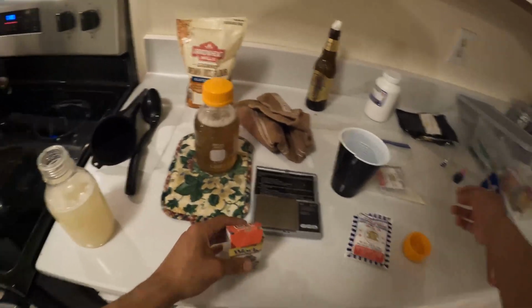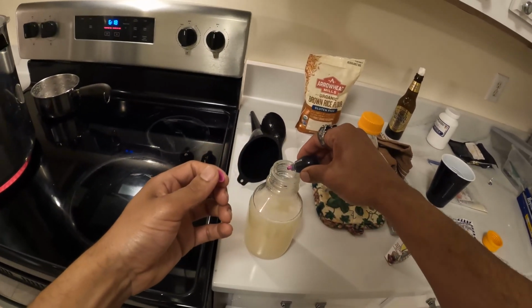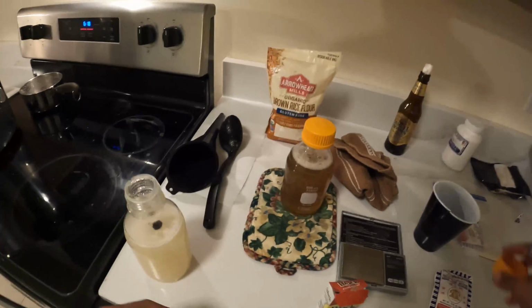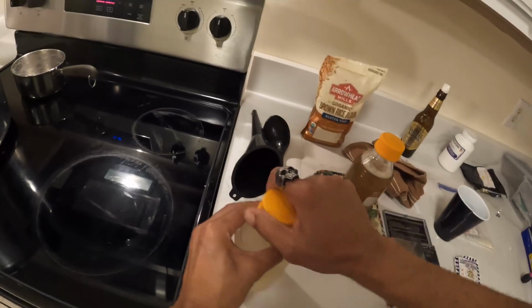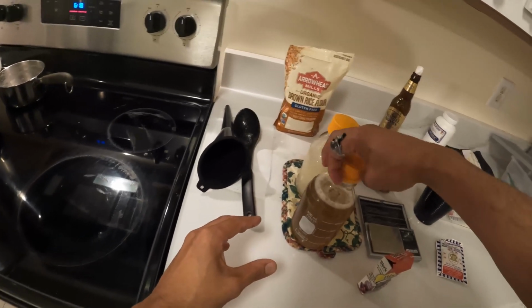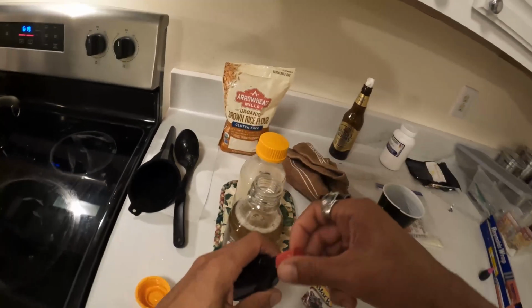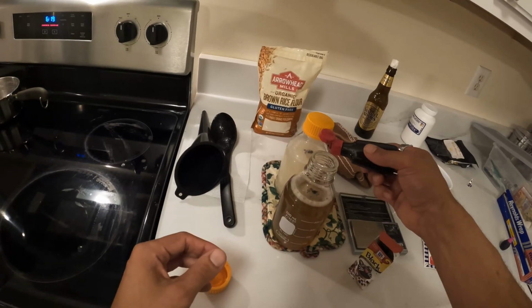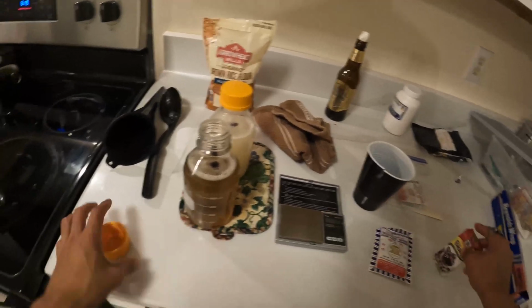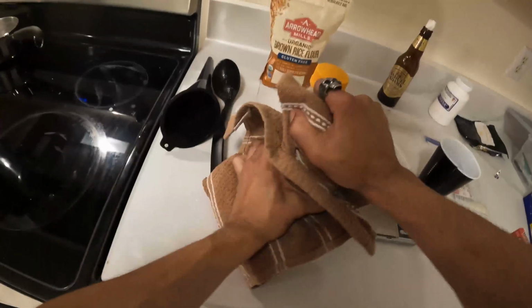So for this brown rice flour agar, I'm actually going to do a purple here. And for my grain water agar, I'm going to go with the black. And it just helps me keep up with what I have on the plates. So now what we'll do is give them one more good shake and get them ready to go in the pressure cooker.